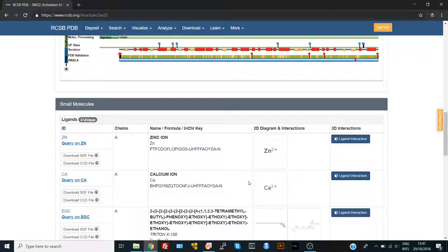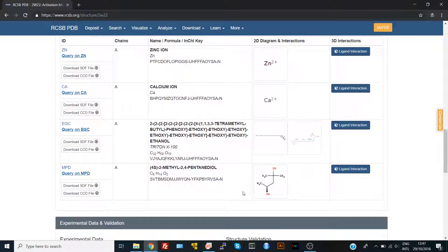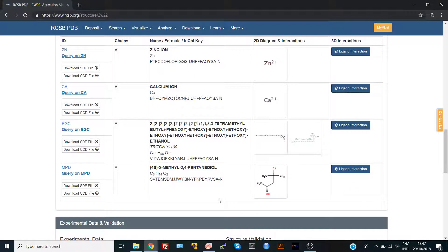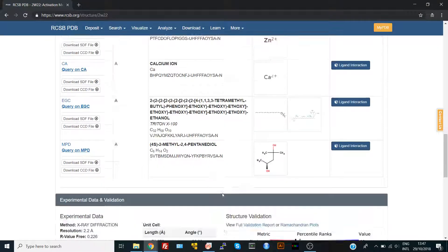For example, in this protein we have two metal ions which are critically important to the structure. If you are going to perform different computational studies, you have to check the number of metals in this structure. We also have here the substrate and a detergent or another molecule from where it was crystallized during the crystallization process.